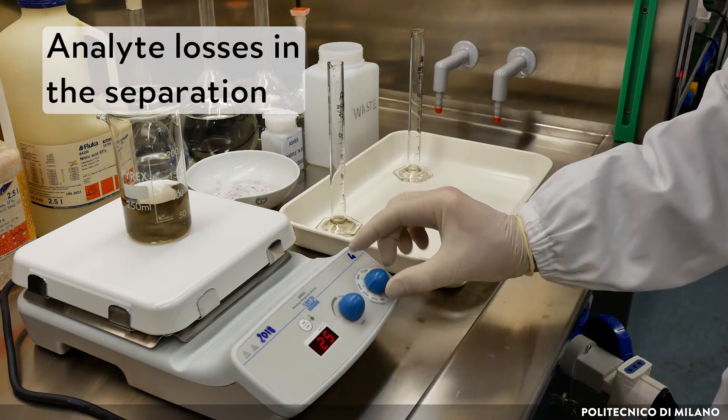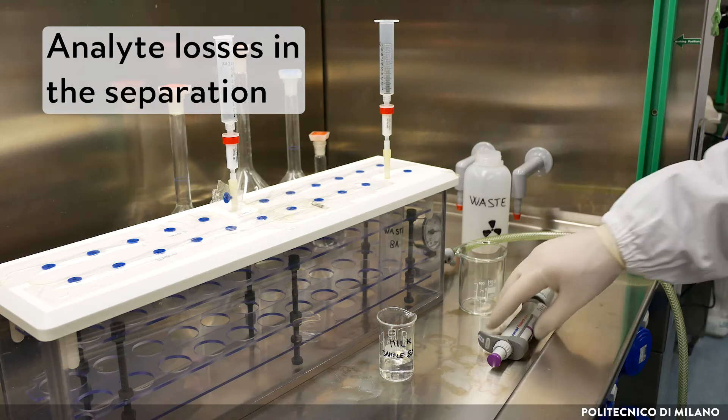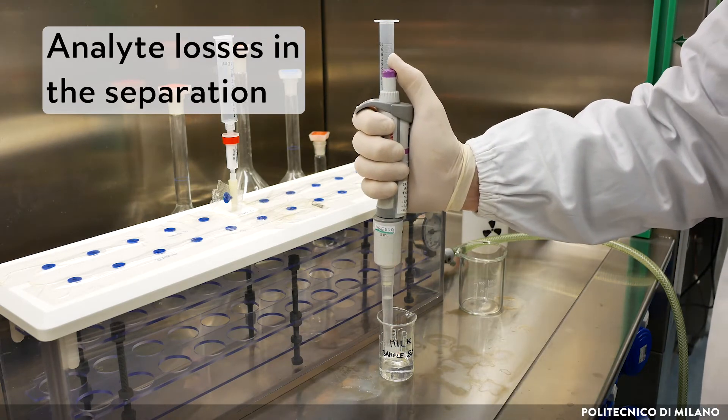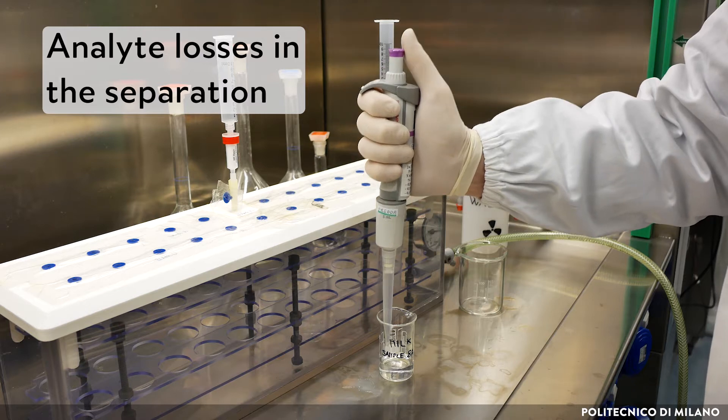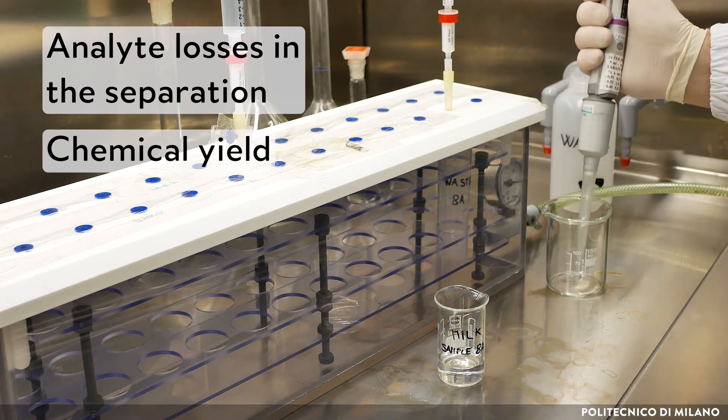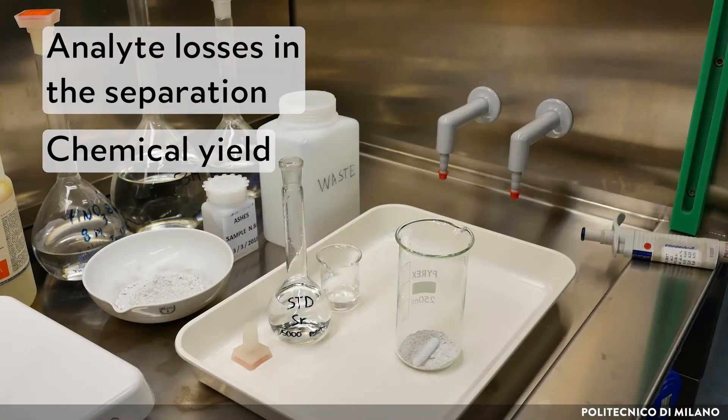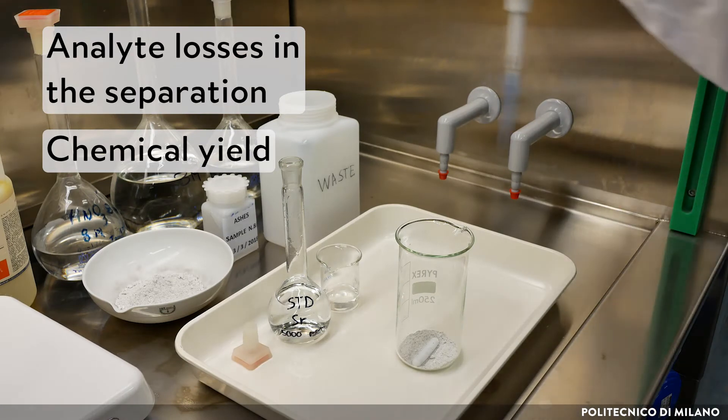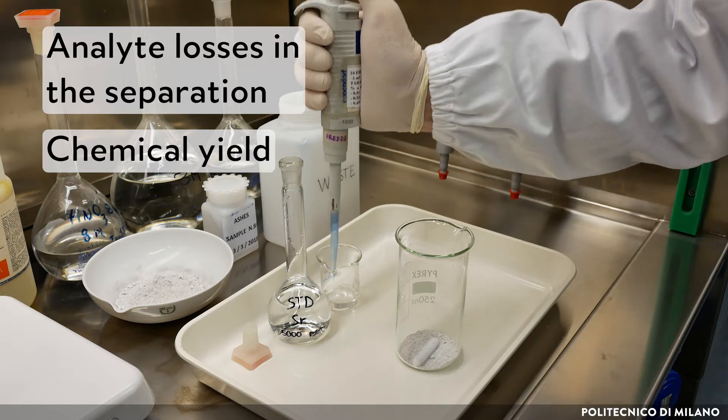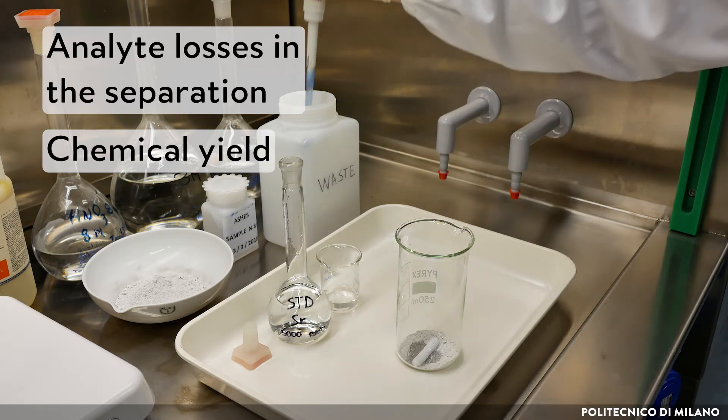During the chemical separation, not all the analyte can be separated and recovered in the final sample used for the measurement. Some portion of the analyte is lost in the separation process. To find out the proportion of the analyte recovered, the chemical yield has to be measured. The chemical yield is determined with the aid of a stable carrier or a radioactive tracer. In this case, stable strontium is used to monitor the method yield.